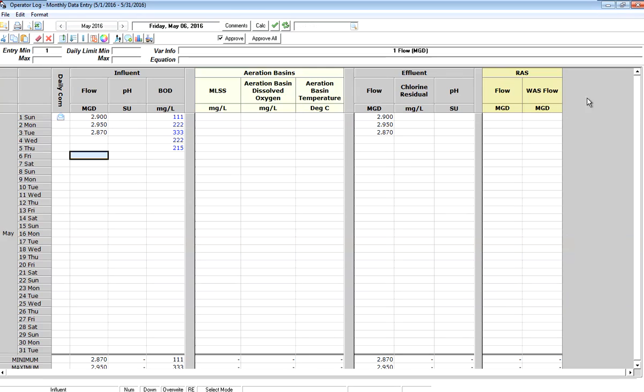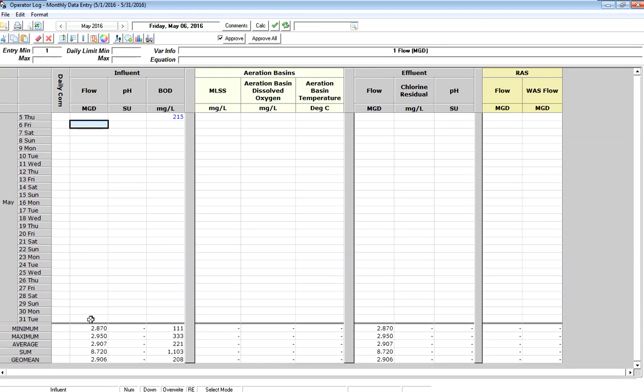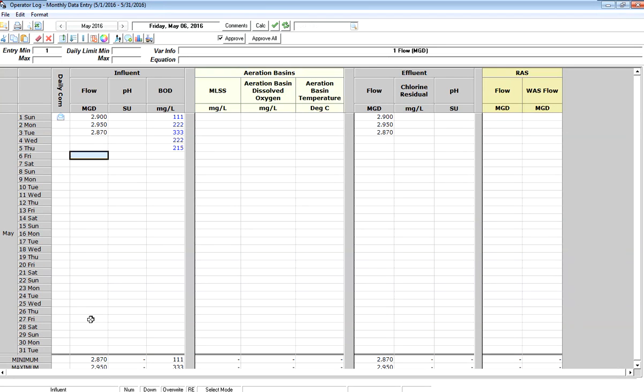I've got columns of data - that's how monthly data entry works - for each of my variables. So here I see my variable for flow, for pH, and it's displaying a month of data with some summary statistics at the bottom.